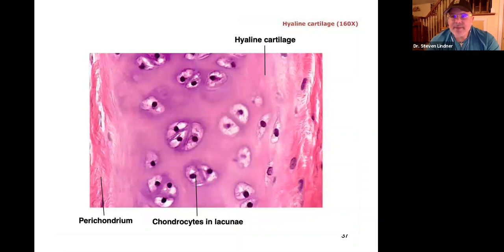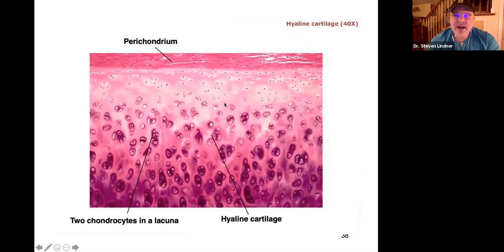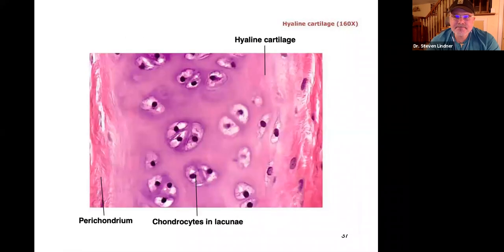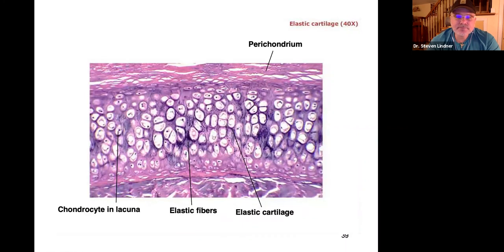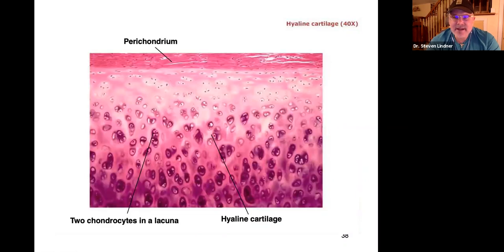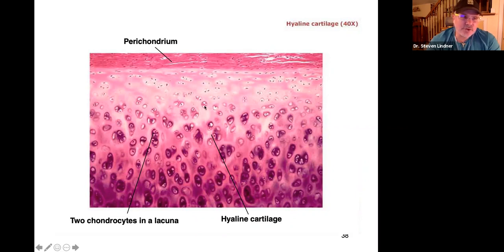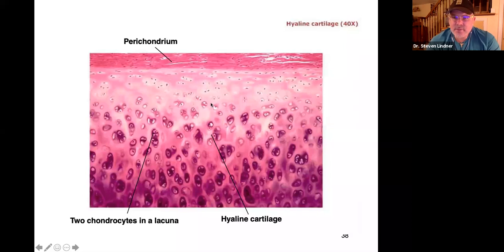Now we have cartilage. The key feature to identify hyaline cartilage is those hollowed-out raindrop shapes — the chondrocytes in their lacunae. This is the perichondrium around them. Hyaline cartilage is found near diarthrodial joints — shoulder, hip, knee, ankle, fingers, elbows — any freely movable joint.